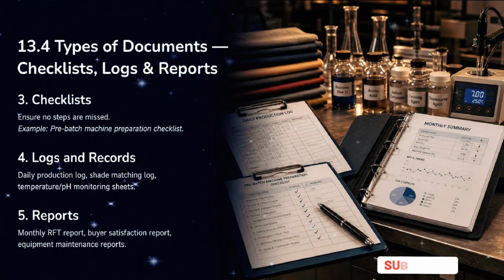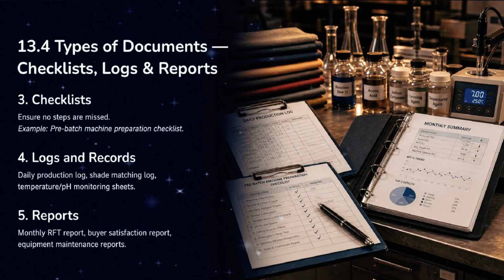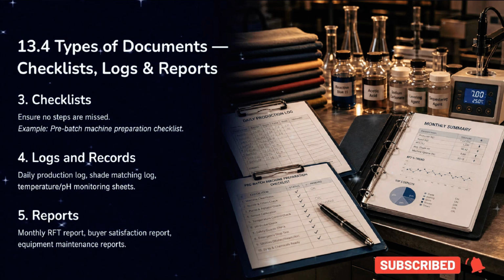To maintain order, we also utilize checklists, logs, and reports. Checklists ensure no steps are missed, while logs and records capture daily operational data. Reports, such as monthly RFT reports, provide a high-level view of lab performance.